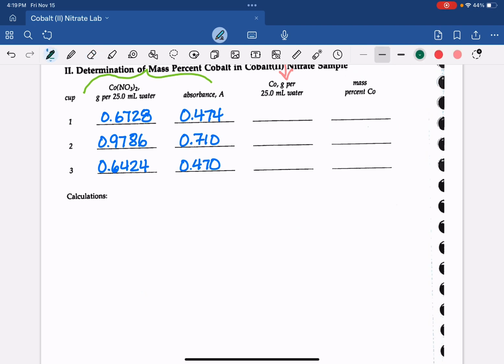Okay, we're using the equation absorbance. I started to rearrange it on you. Absorbance is equal to the concentration times epsilon, which is the slope. So if we rearrange that to get the concentration, that means that concentration C is equal to the absorbance over your slope value.